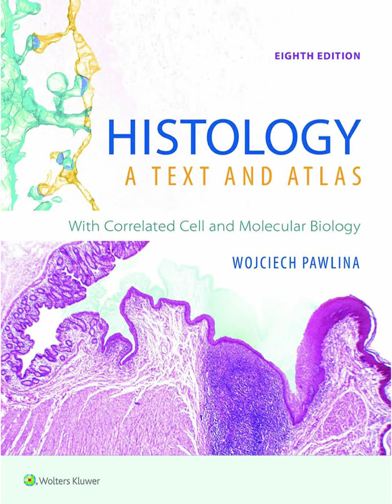What about confocal? I hear that term a lot. Confocal scanning microscopy is another sophisticated technique for getting sharp 3D images. Its trick is using a pinhole aperture placed in front of the detector. This pinhole physically blocks any light that comes from outside the precise focal plane you're interested in. So it rejects the blurry, out-of-focus light. Correct.